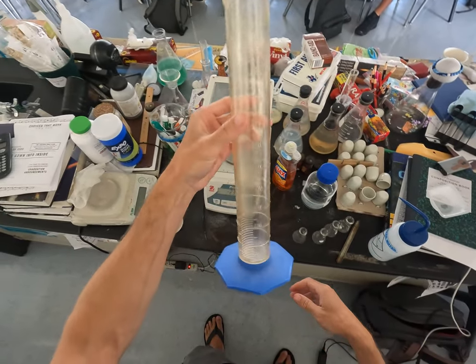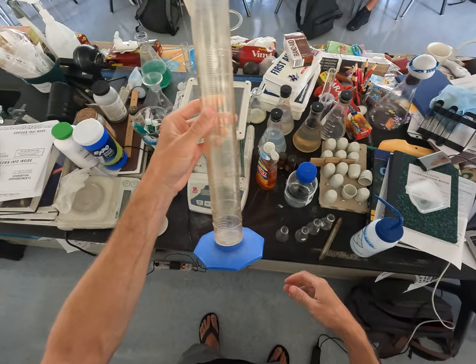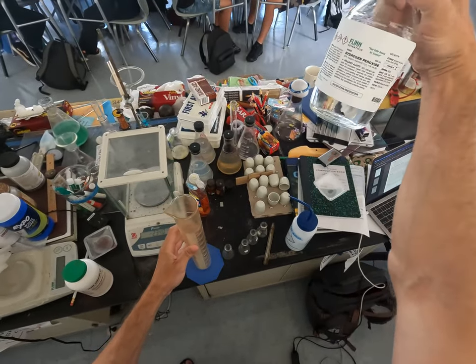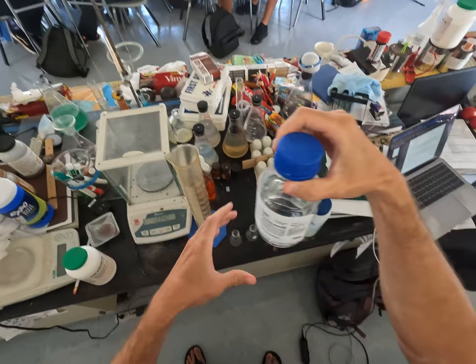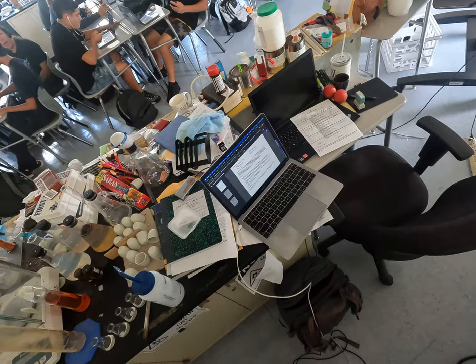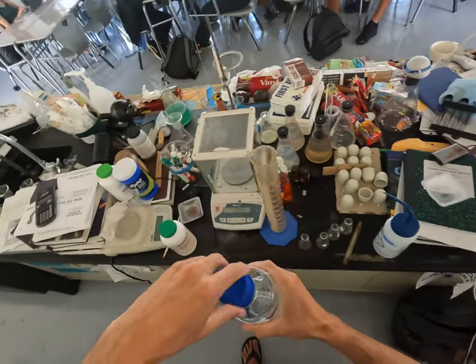This is period one chemistry. So I have here hydrogen peroxide — it's 30% hydrogen peroxide. I'm going to put, I think I said 40 milliliters of it.